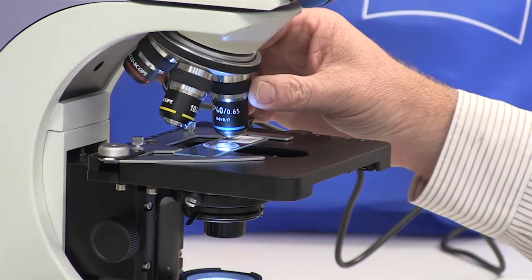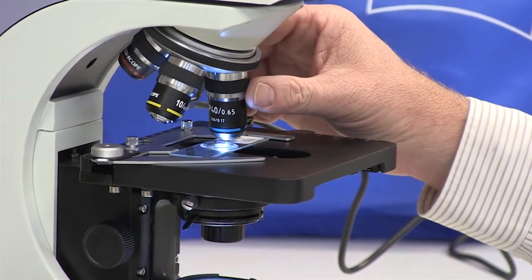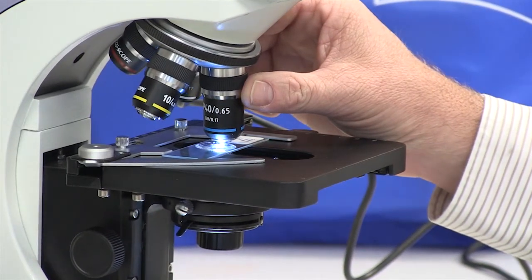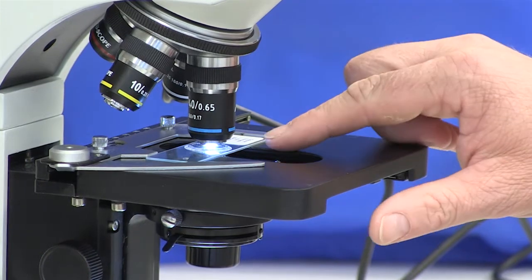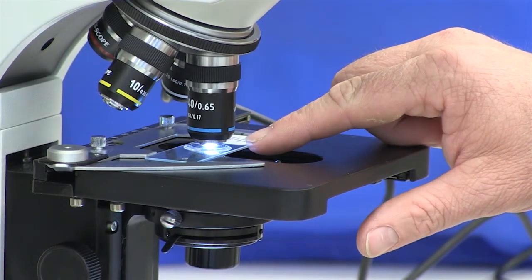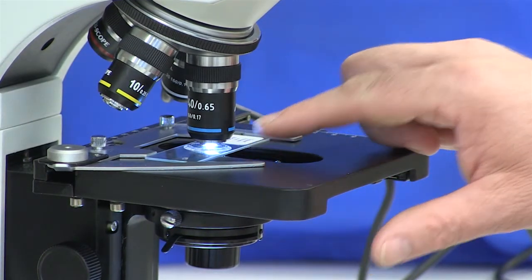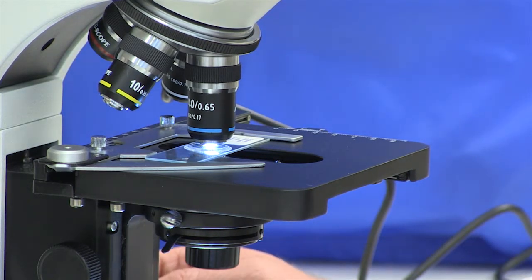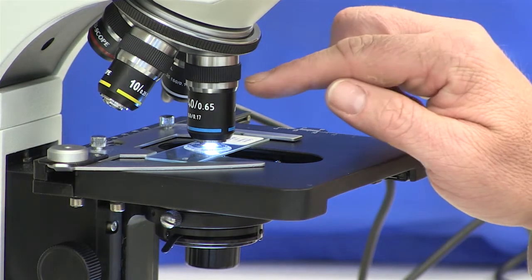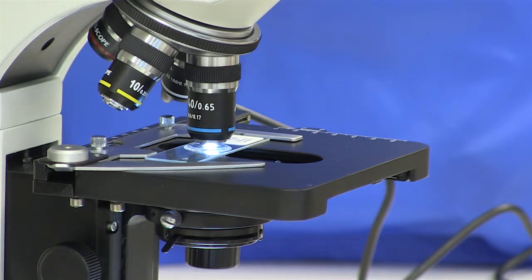You'll see that there's going to be very little space, what we call a working distance, between the high power objective and the specimen—just a very small distance. Therefore, we only want to use the fine adjustment knob to make adjustments to our working distance when we have the high power objective in place.